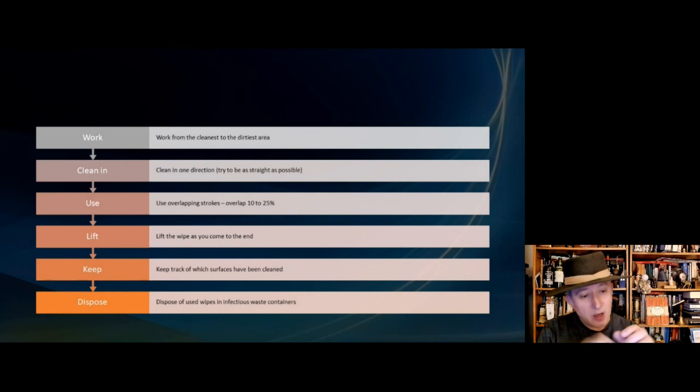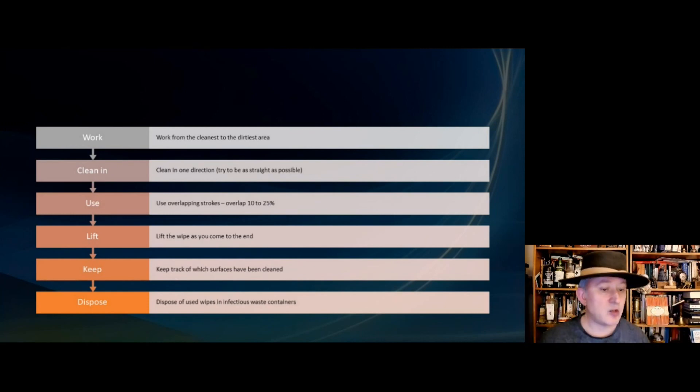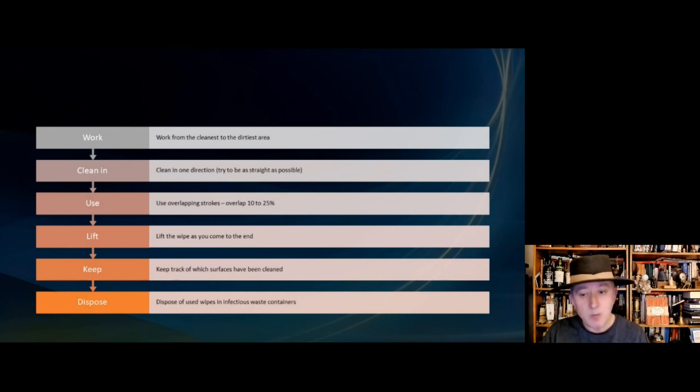We also have to make sure that we're doing slightly overlapping strokes — about 10 to 20 percent overlap — and that's to avoid missing anything in the middle.